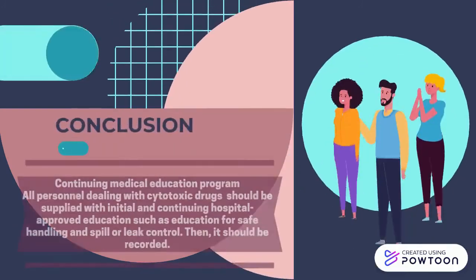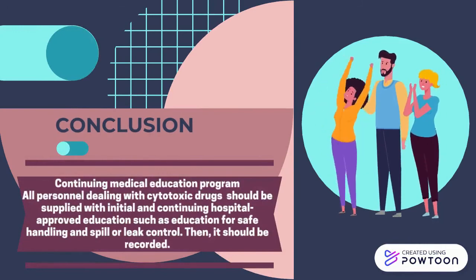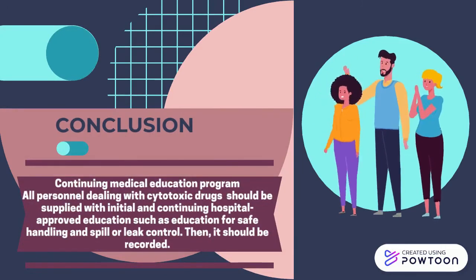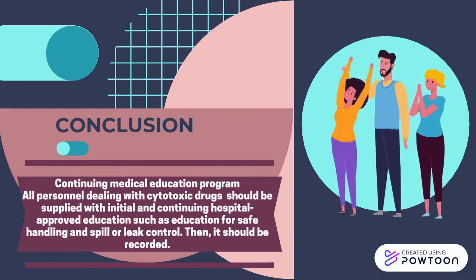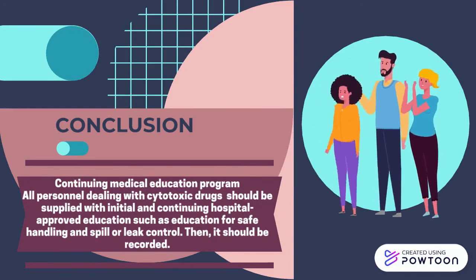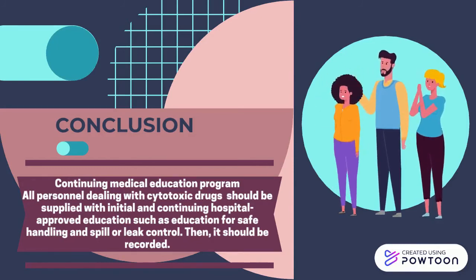Fourth, continuing medical education program. All personnel dealing with cytotoxic drugs should be supplied with initial and continuing hospital-approved education, such as education for safe handling and spill or leak control. Then, it should be recorded.